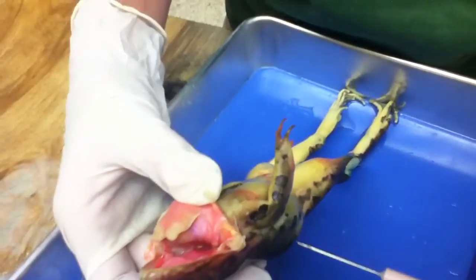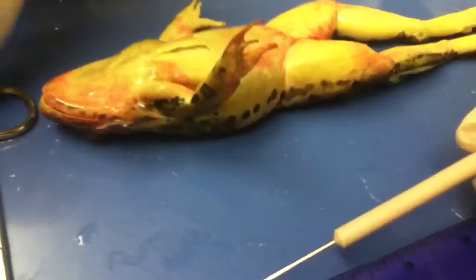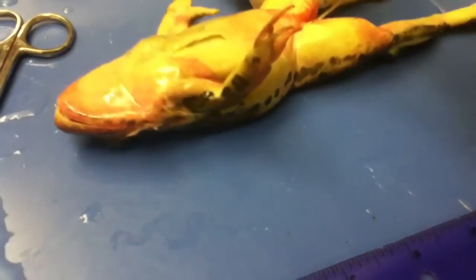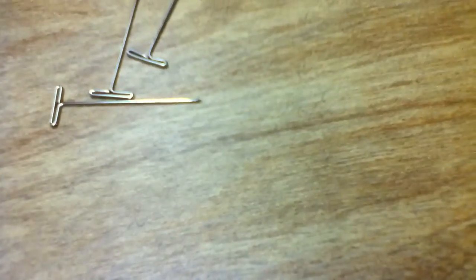Did your frog have eggs? We don't know. Let me read the next instruction. Look for the opening to the frog's cloaca located between the hind legs. Use the forceps to lift the skin and use the scissors to cut along... I think you have to pin it down now. Hand me four pins please. You should have gloves. Oh, these pins are clean. Okay, that's why I'm having her hand them to me.